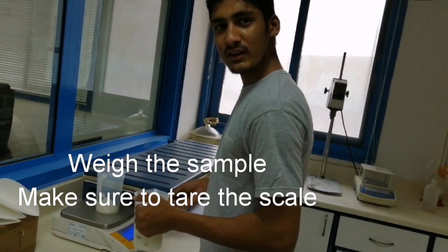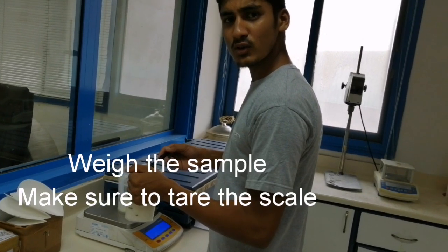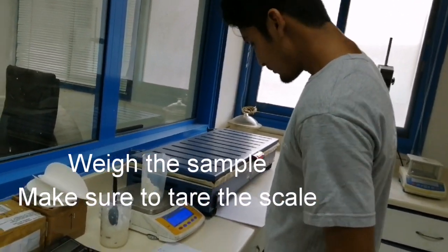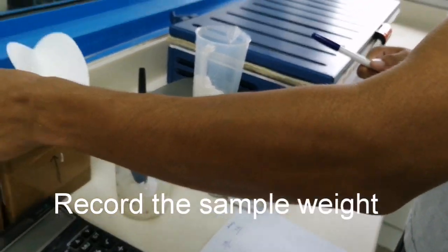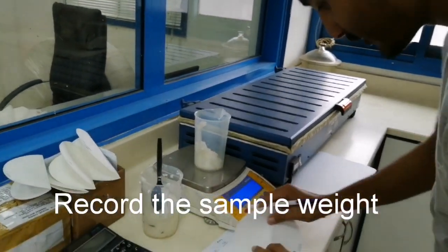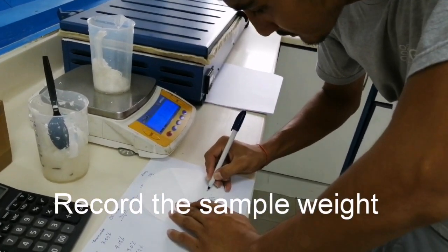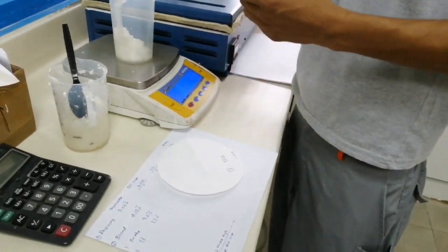It depends. Like machine chest — three samples — but it's not necessary. Okay, then you have to record the weight. This is filter paper. Filter paper is also weighed — all is weighed. So you have to record the 9.767 for the filter paper.